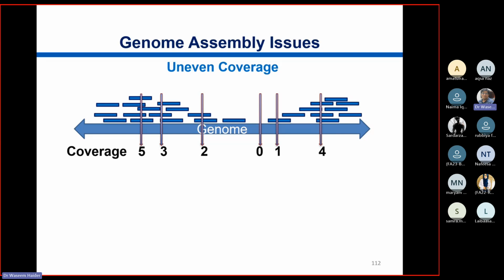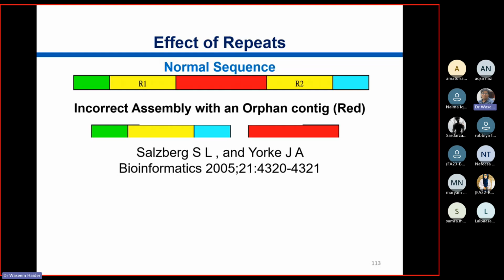But this coverage is uneven. In reality, some of the regions get good fragments and they get sequenced very well, while some of the regions might be missing. Overall, once we assemble them, the average coverage is again recalculated. So again we recheck. On average, across all the positions, it should be more than 30x. In that case, it's a good number.